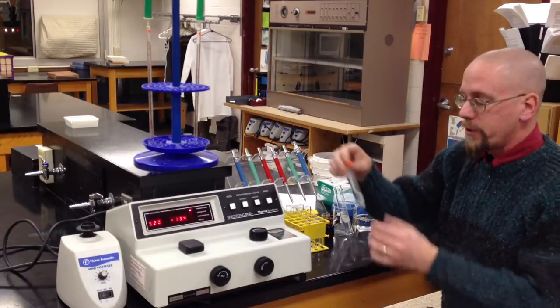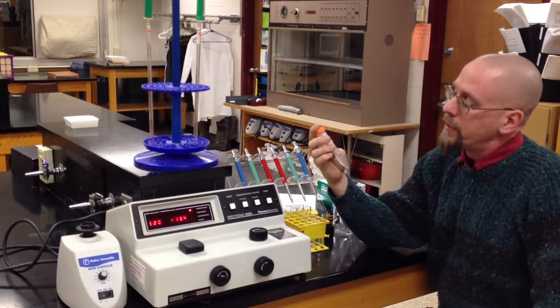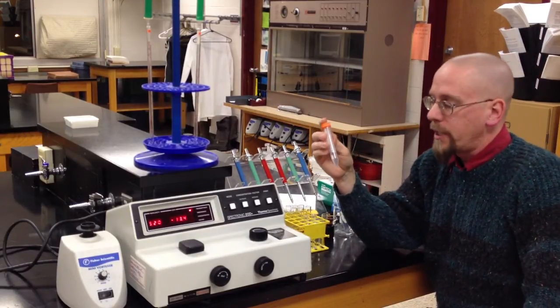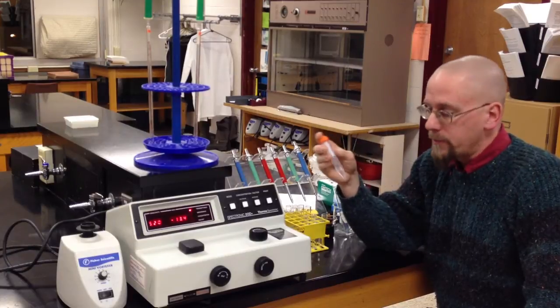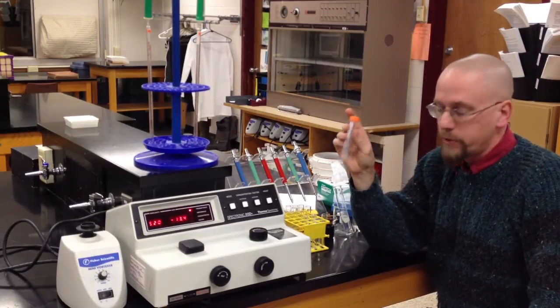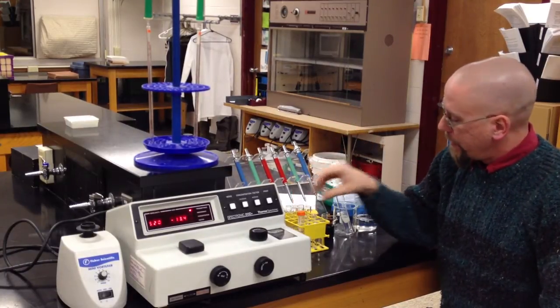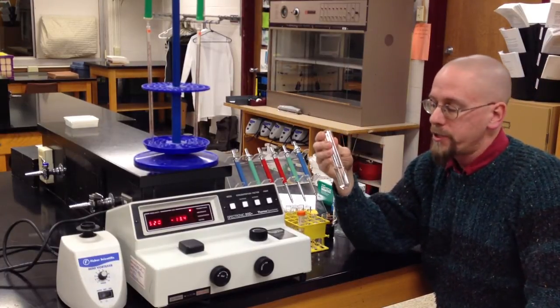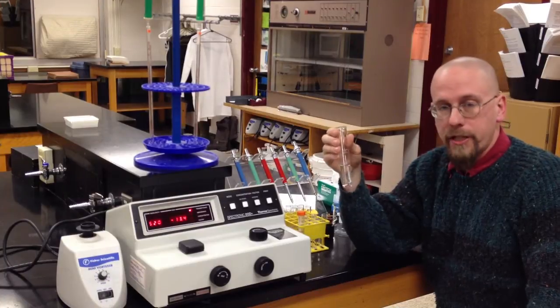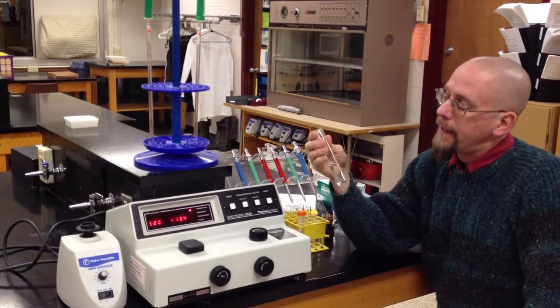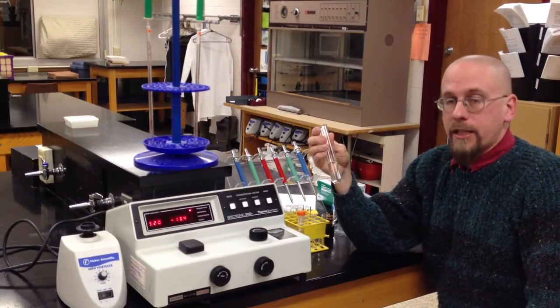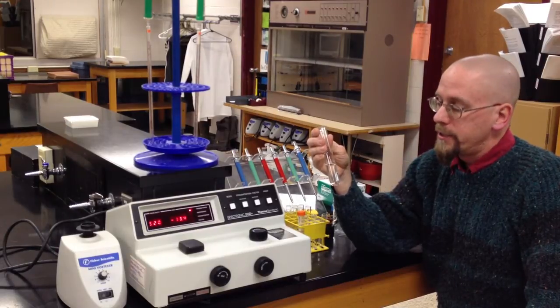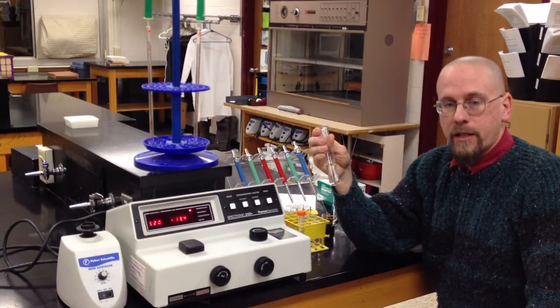So what we'll have when we come to lab is samples of saliva that you will supply once you come to lab. It'll be your spit. And we will provide you with a solution of 1% starch. Starch is the substrate for amylase. And when amylase comes into contact with starch, it degrades it down to simpler carbohydrates.